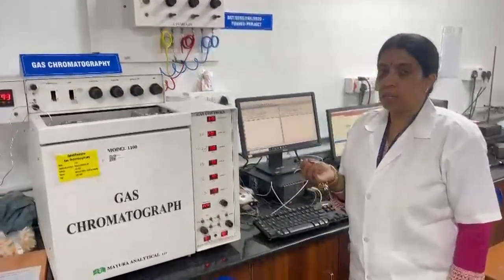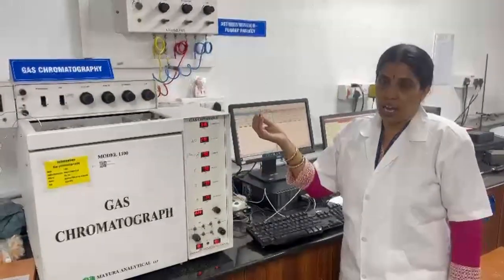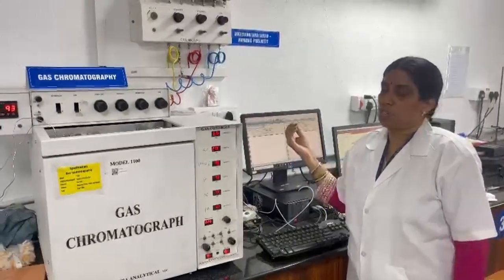Now we have taken a gas sample in the gas-tight syringe and we will be injecting it in the gas injection port with a small demonstration.